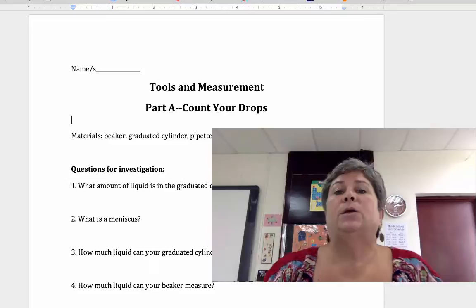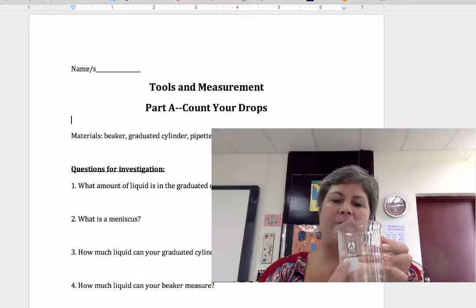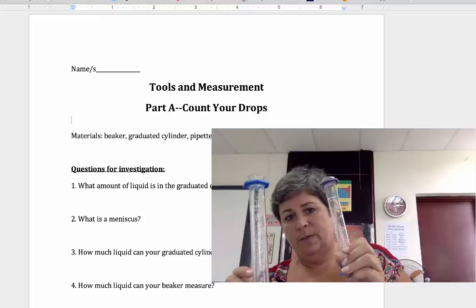The materials you will be using include tap water, a medium beaker, and a larger beaker. This is a 500 milliliter beaker and this one is 250, so it's half the size. You will also be using graduated cylinders — a bigger one that is 100 milliliters and a smaller one that is 50 milliliters.